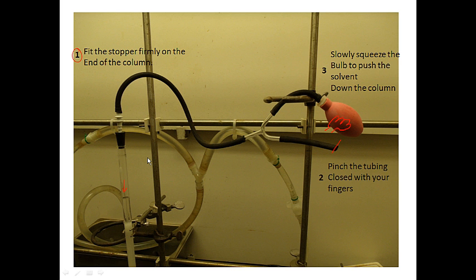And this is why this is a more than one person operation, because it takes one person to carefully push the column and then another person to collect the samples and basically say to stop because your test tube is half full. So how do you stop? Well, the second part of this is the pushing part.